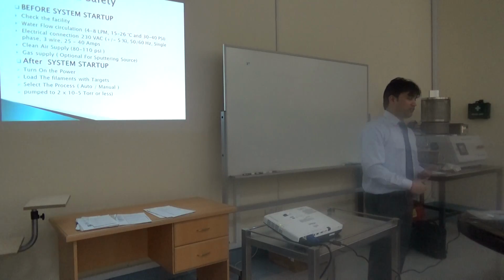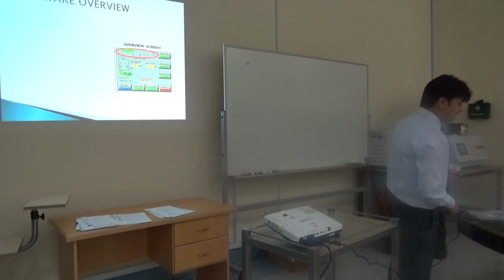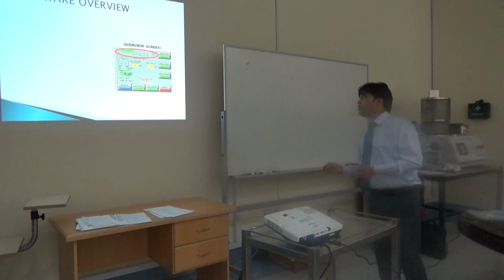Under the vacuum conditions. Next, about the software overview.